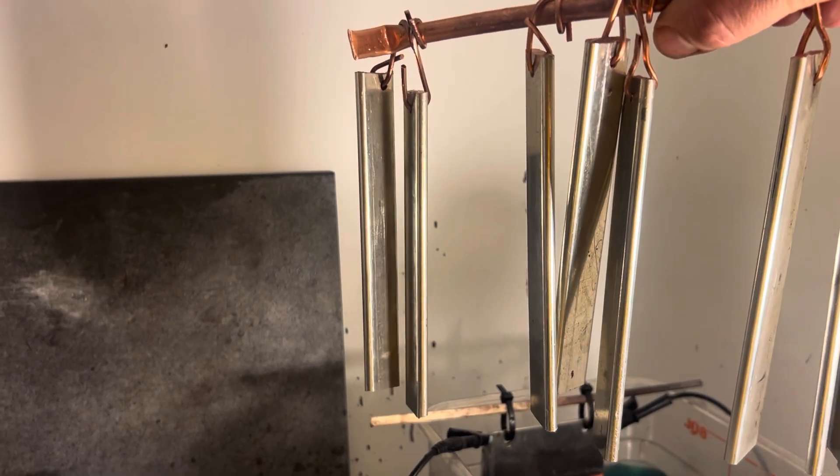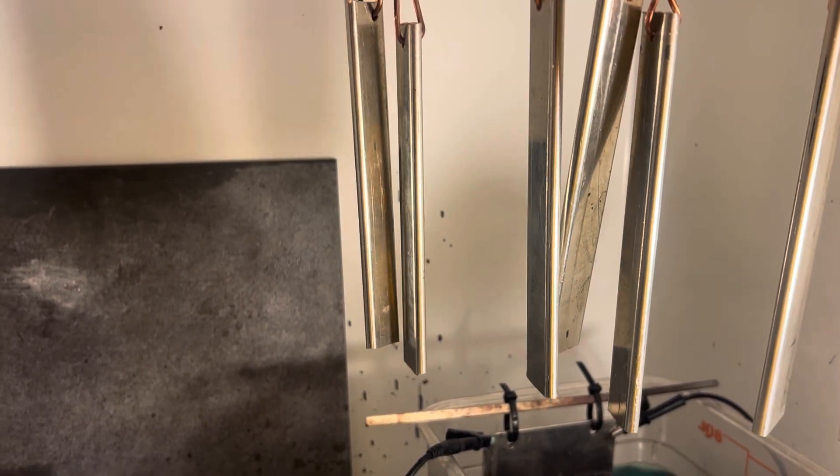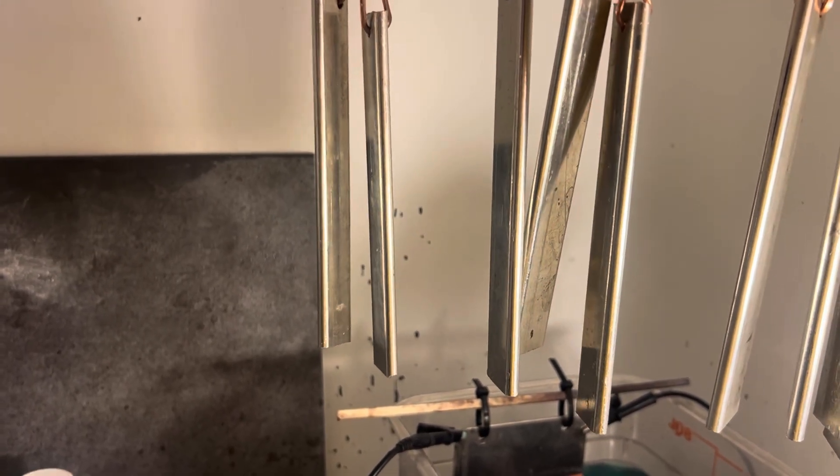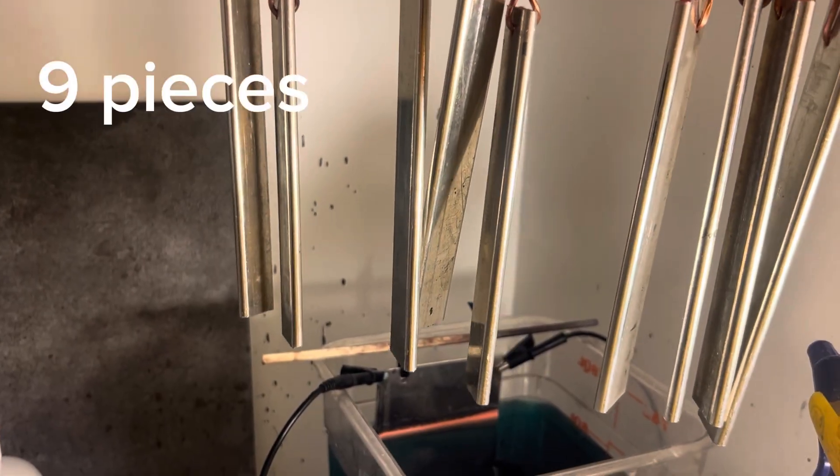We are going to upsize — I've made nine bars and I'll put those in there. This silver plated project is coming along really well with the copper sulfate.